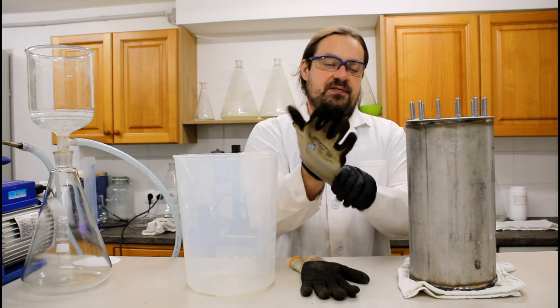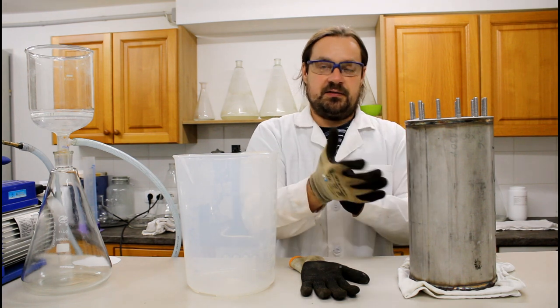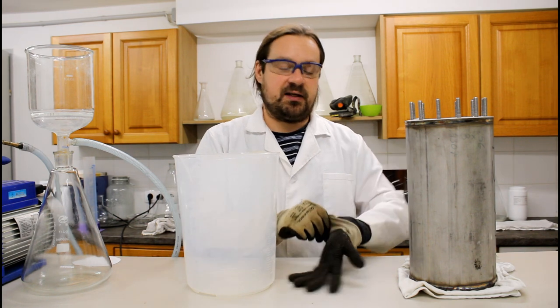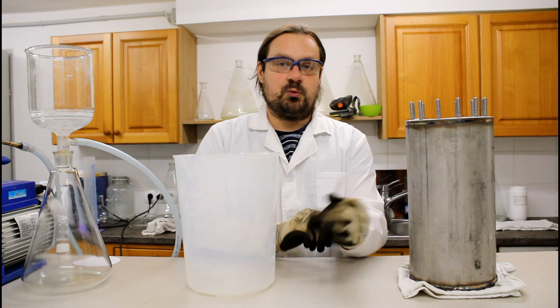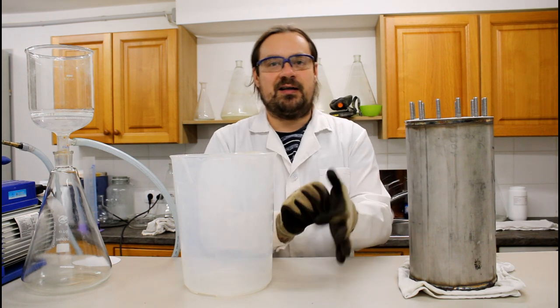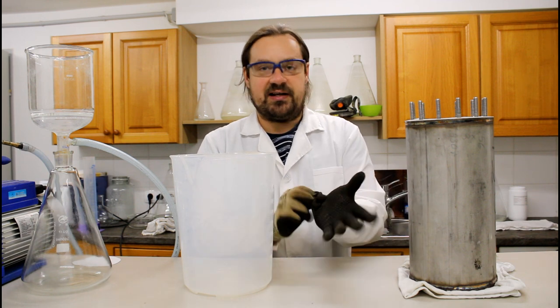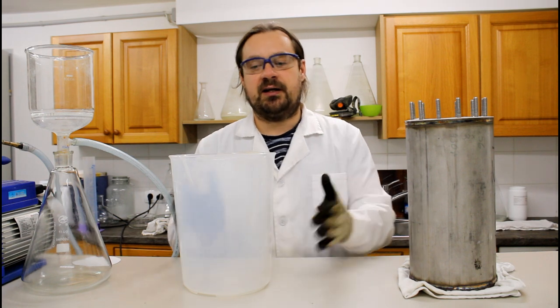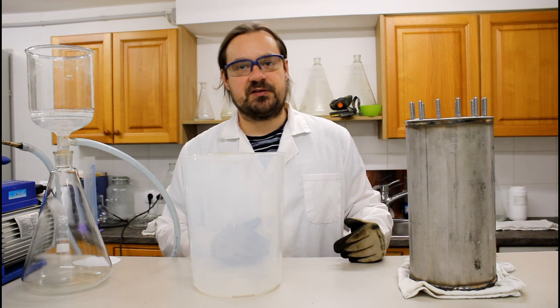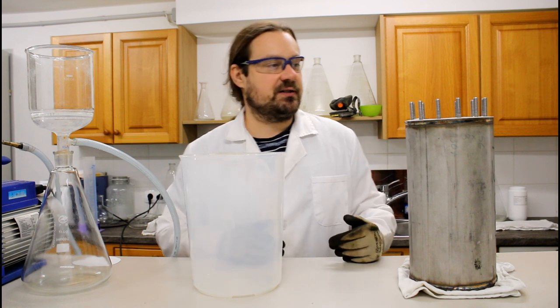In this step, it's very important to take care about your safety. So wear goggles, wear gloves, and if you don't want to waste your clothes, then it would also be recommendable to wear a lab coat or something like that, because sodium hydroxide is very aggressive and it will destroy your clothes if it gets onto it. You know, just a little spot of it will just make a hole and that's it. So wear a lab coat and you're fine.